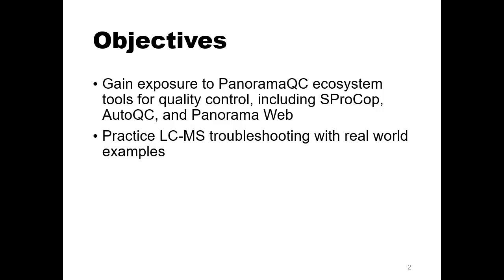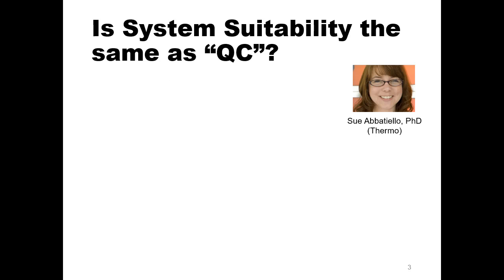So I have two main points that I hope you take home from this section. The first is gaining some exposure to Panorama QC. You're already ahead of the game because you already have exposure to Panorama Public, so Panorama QC will just be an extension of what you just learned. And second is, if you don't already have a little bit of an intuition for LC-MS troubleshooting, I hope you gain some perspective on what good system suitability should look like.